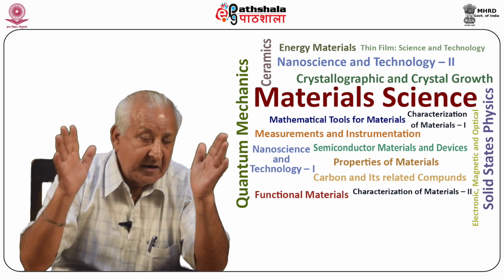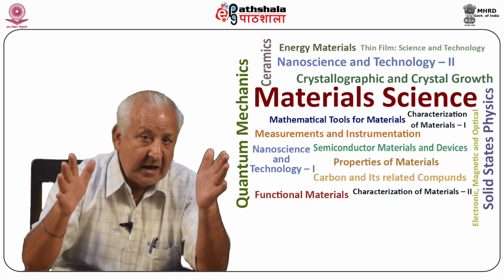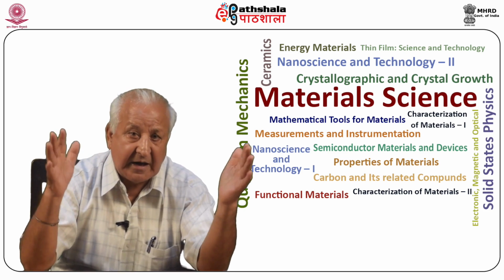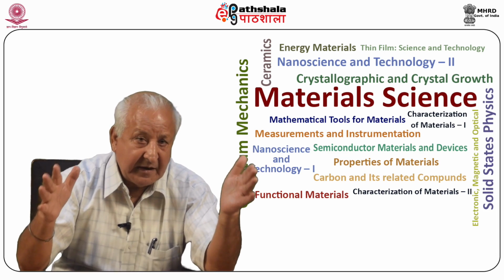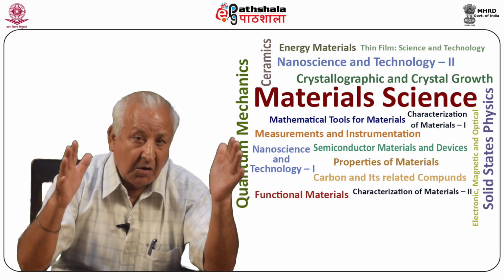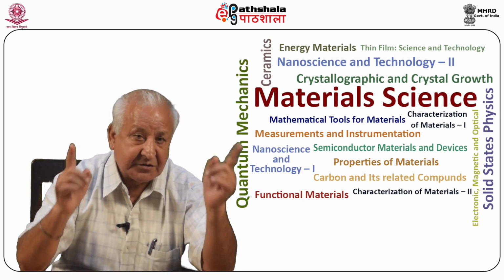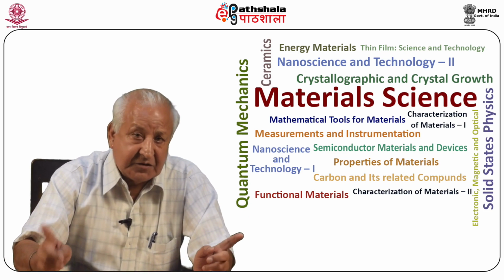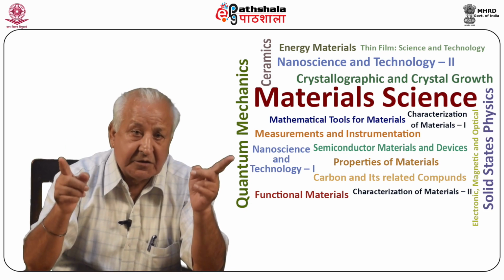The gel medium remaining chemically inert and harmless, the gel frameworks act like a three-dimensional crucible in which the crystals are delicately held in the position of their formation and growth, thereby preventing any damage due to impact with either the bottom or the walls of the container. It forms a three-dimensional structure by entrapping water. The gel, being soft and porous, provides a flexible environment for crystals to grow.